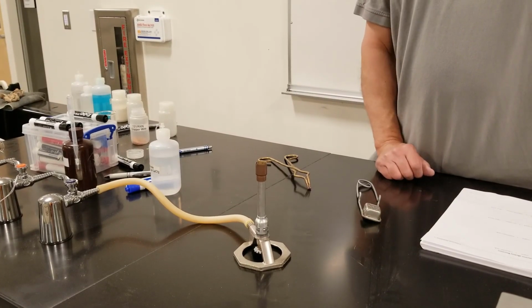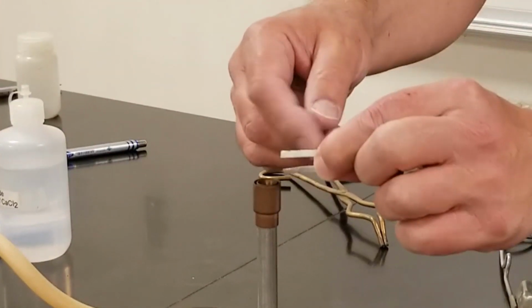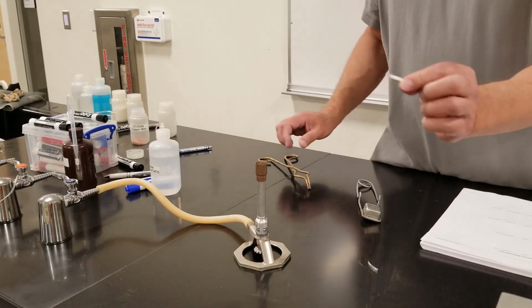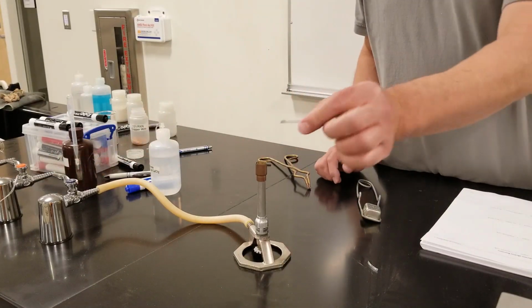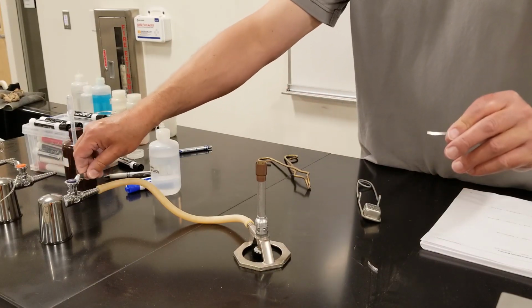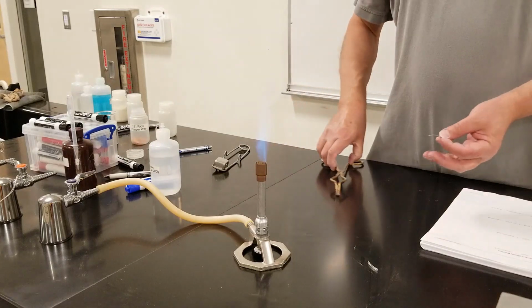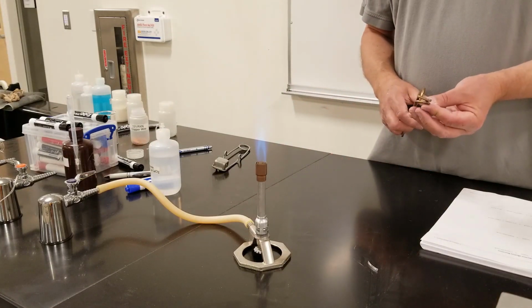Okay, page 99, the second reaction is reacting magnesium metal. This is magnesium metal, very, very small, lightweight strips of magnesium. We're going to react those with oxygen. This is a lot more impressive than the copper. So, most people don't think of metals as burning in the air.